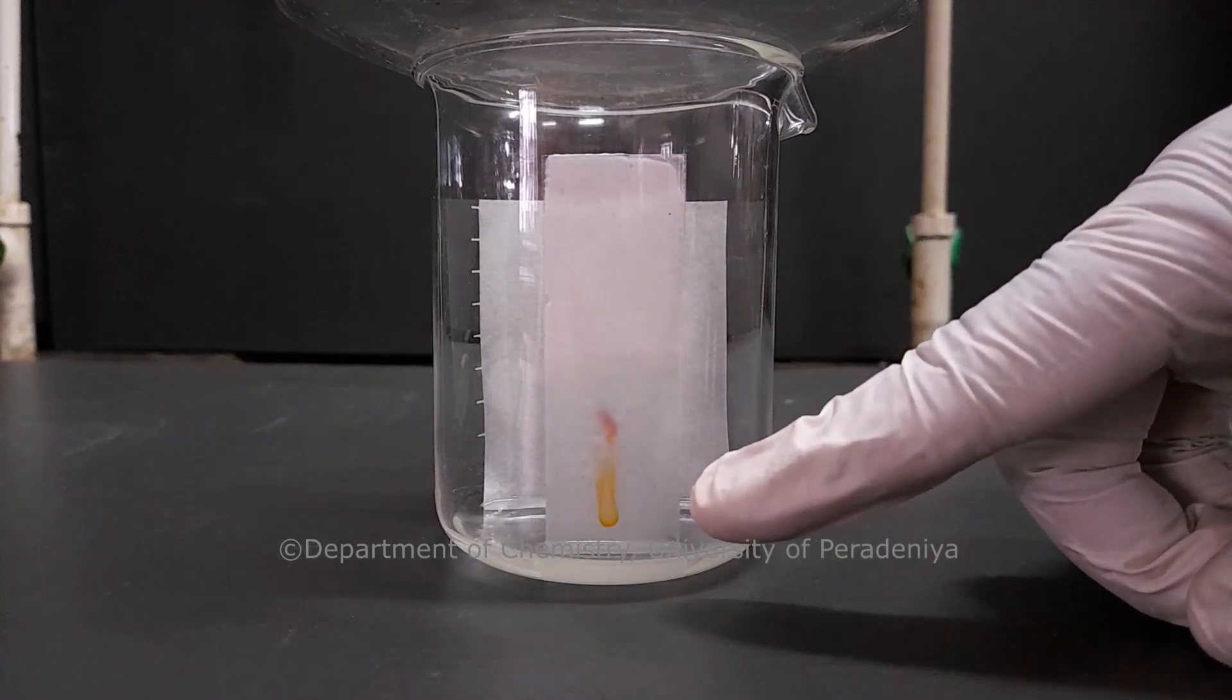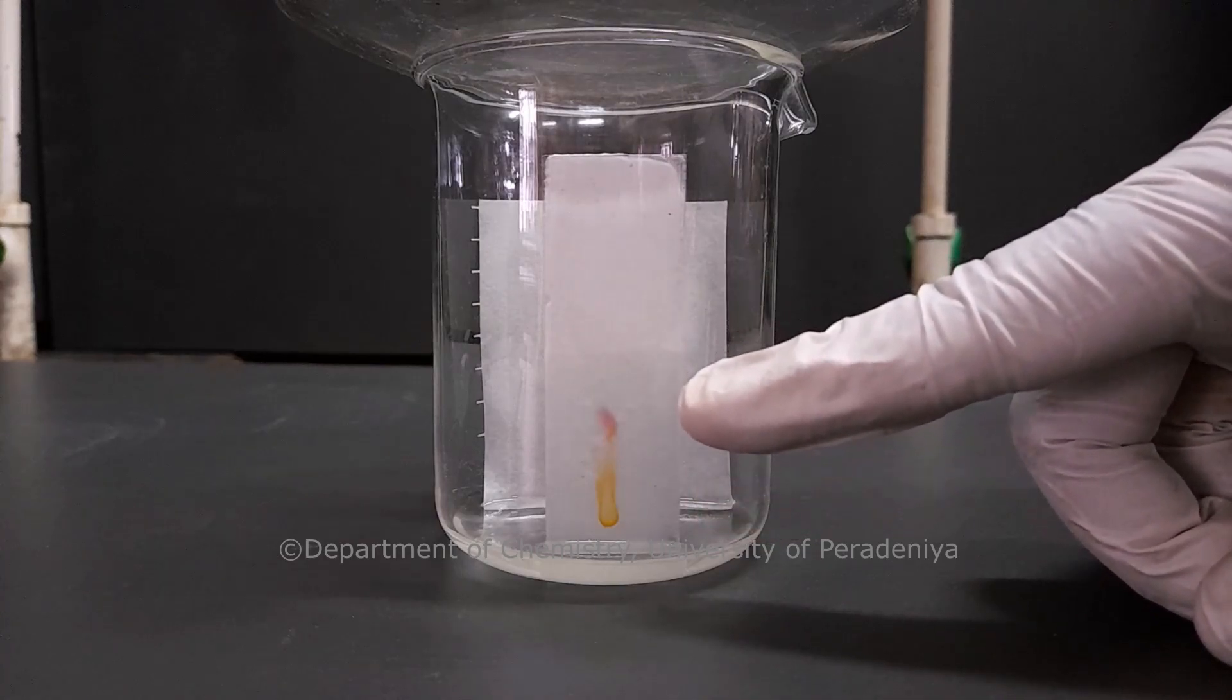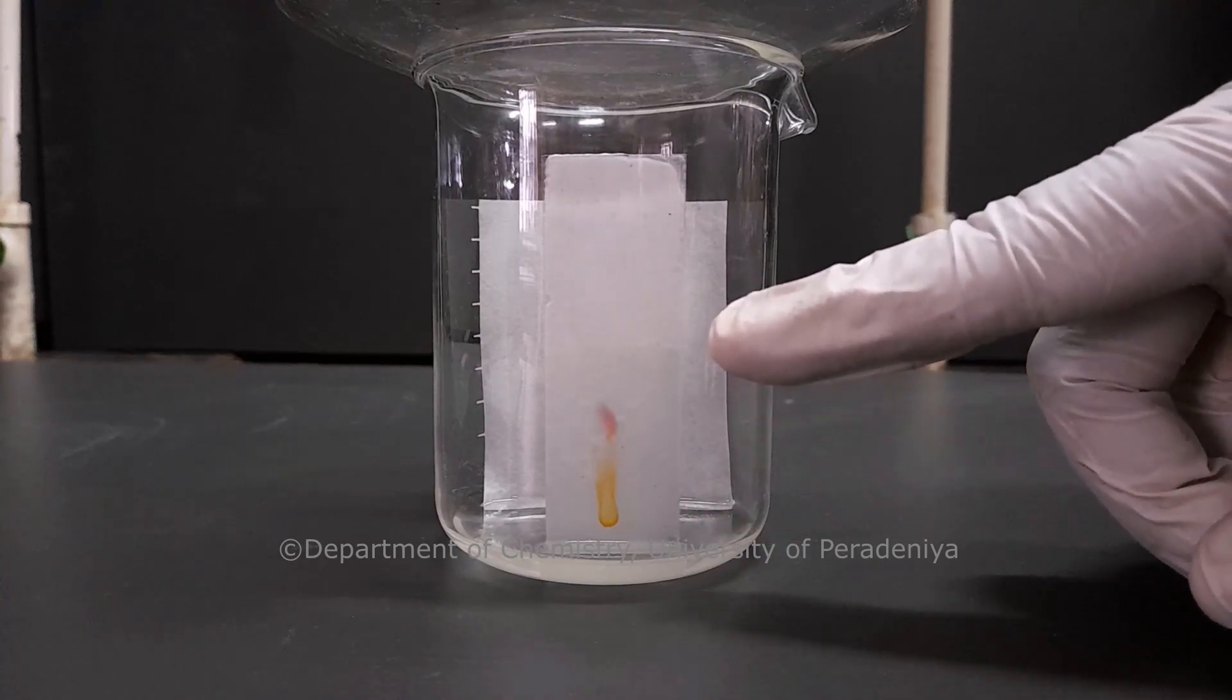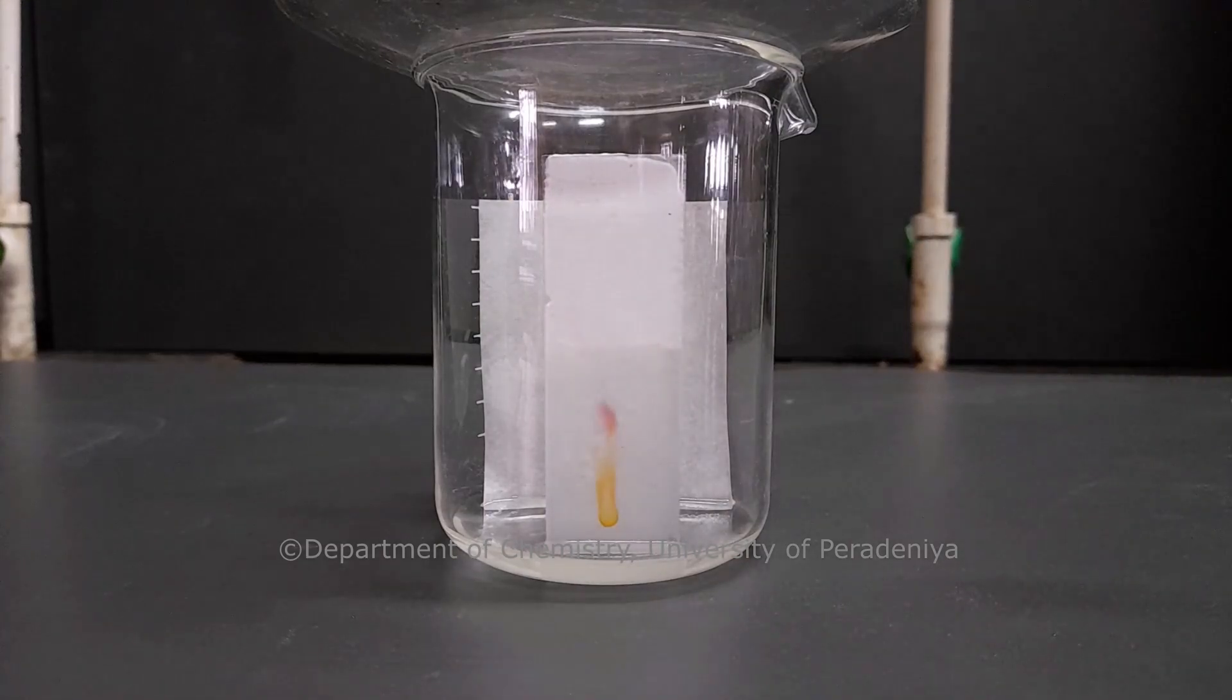The components which have stronger interactions with the solvent will move faster, and the components which have stronger interactions with the stationary phase will move slower through the plate.